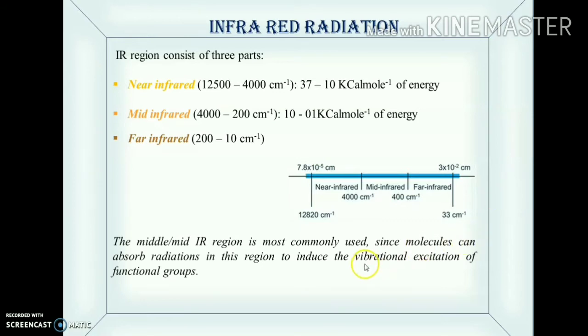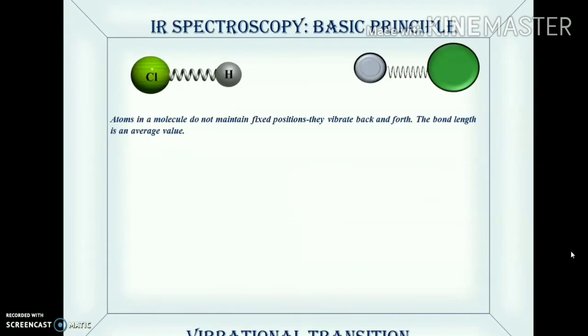Now, once we have mentioned that vibrational excitation of the functional groups is there, let's try to understand what this technical term refers to. For that sake, we need to learn the basic principle of IR spectroscopy. That is, what are the pillars on which this technique is based?